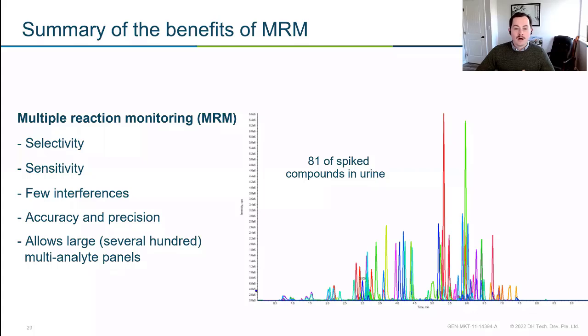And in terms of how long these experiments take, typically on the low end, we're talking about around 10 milliseconds for dwell time. But obviously we'd like a little bit more. So if you can keep it around 50, you're usually in really great shape. But if we think about how many experiments you can do in a second, if each one takes 50 milliseconds, right, it's a lot.